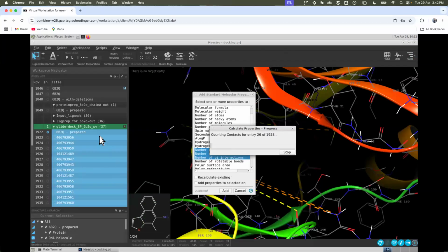Okay, I guess there are so many entries here. But let's calculate. Yeah, it will take some time. Please do this calculation. I don't know why it is taking so much time here in the cloud, but in normal software, it will calculate all those interactions instantly.